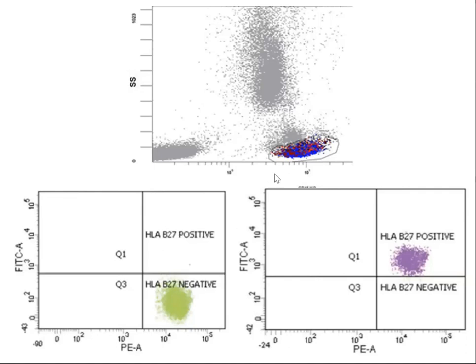Okay, sorry. If it is this particular allele, if it is positive, it's abnormal. If it is negative, it is fine. Because the patients who have this HLA-B27 allele are more prone to ankylosing spondylitis. So I gate the lymphocytes. See, I've gated. Again, I'm using the word gated. I'm drawing a region around lymphocytes, and I'm gating this lymphocyte on HLA-B27, which is on the y-axis.